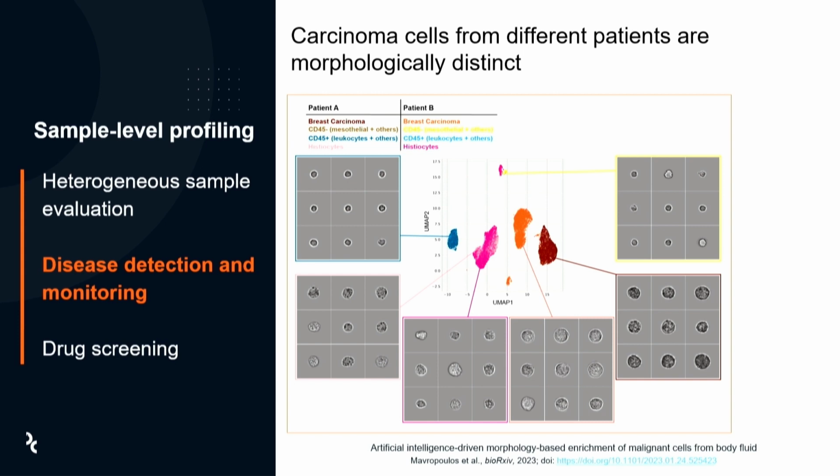And this is because typically in cytopathology, the methods, especially the samples they were working with, malignant effusions, actually have very low tumor abundancy, and they are limited by high background. So because of the high background and the low tumor cell number, you end up having a lot of noise in the system, and you really can't get highly sensitive detection of those rare cells. And so they wanted to see if by sorting and enriching for the carcinoma cells using Deepcell and by morphology, they could get a more rich population of cells to look at for their patients. And so that's indeed what they did here.